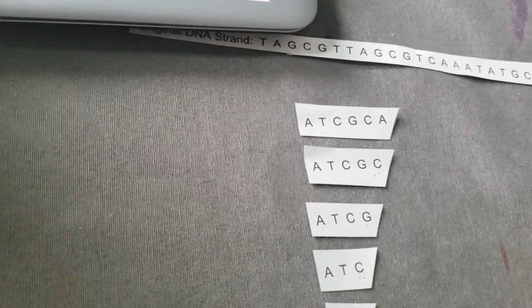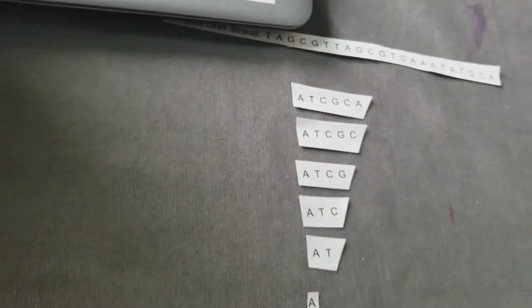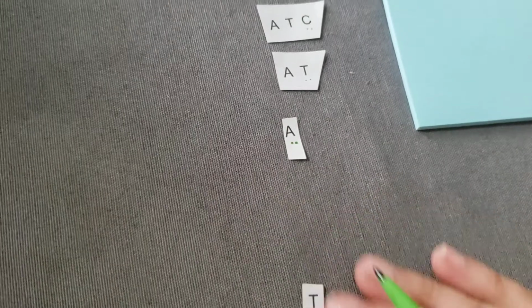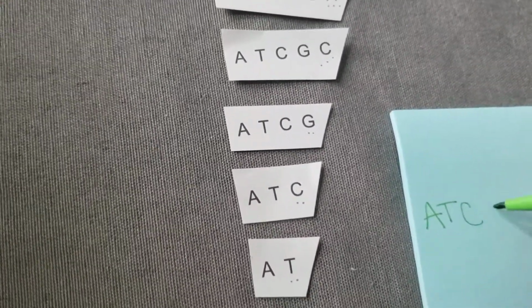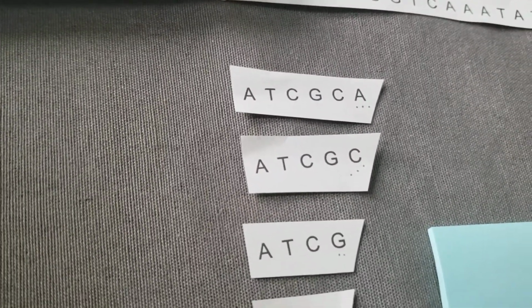Continuing on, the next one would be this one, and the A would have been fluorescent. Okay, so if we take all of this and we start paying attention to what the fluorescence is, we start with an A. The next fluorescent was a T, then a C, a G, a C, an A.